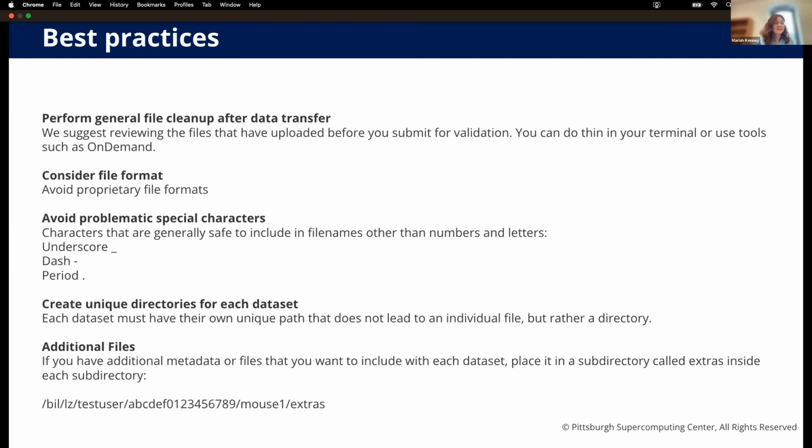Yeah, so the definition of raw data is a little fuzzy, because we are not looking for your proprietary files for you to share, unless you've written it into an agreement that you have with the NIH that you have to share these proprietary file formats. Then, it's not great for the scientific community though. It's not as accessible. So raw data is the raw level of data, but in a format that's accessible.